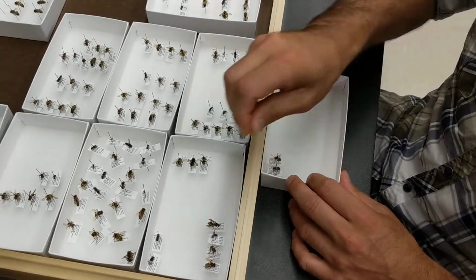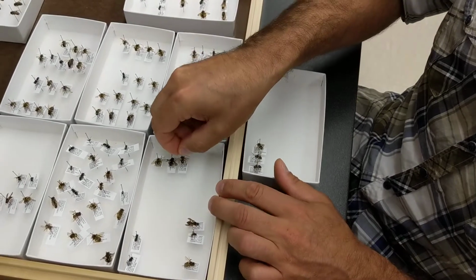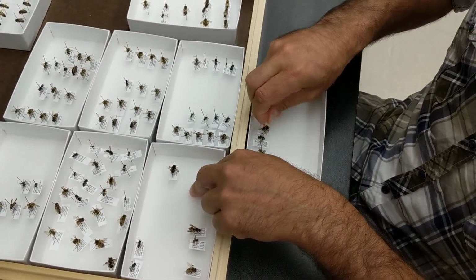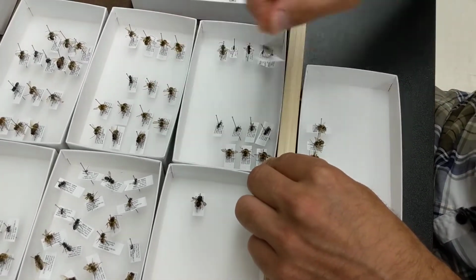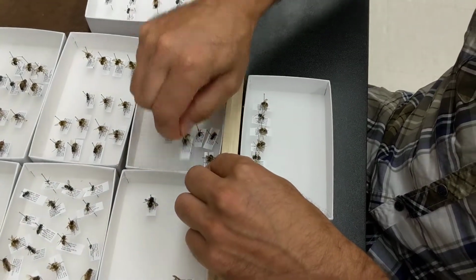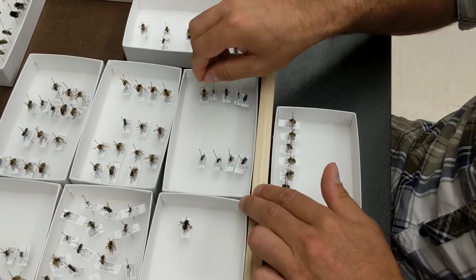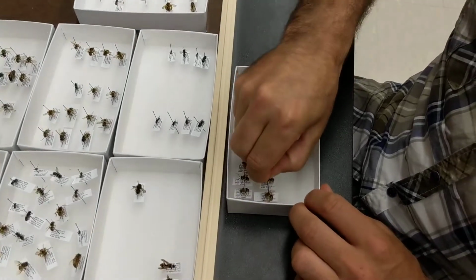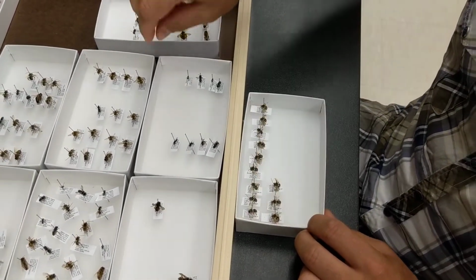These are all going to be male Melissodes, some are longhorn bees, and in these samples there's quite a few because the samples were collected in the summer and in an area where there are lots and lots of composites, which some summer longhorn bees really like. And so you can see that it's quite easy to see all these bees with the antennae that are almost as long as their bodies. And just put those all together.